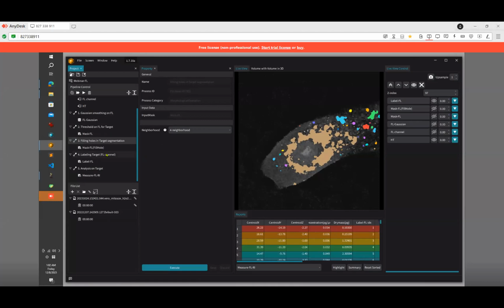At this stage, if you want to control any parameter, you should visit each process to adjust. At the moment it's not that friendly for users, but it's for flexibility. So bear with this at the moment.